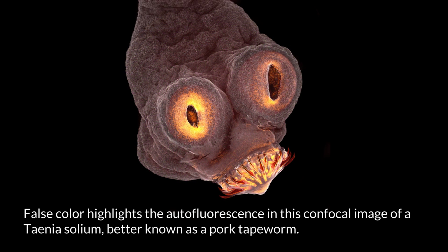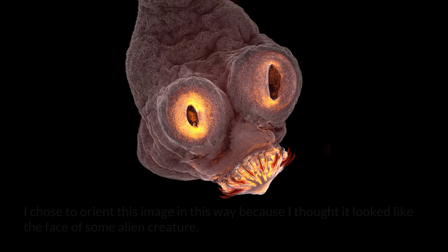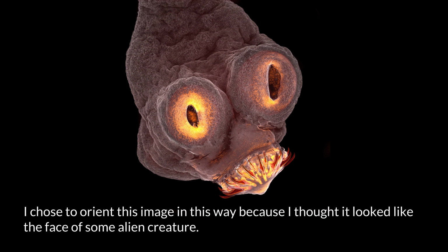False color highlights the autofluorescence in this confocal image of Taenia solium, better known as a pork tapeworm. I chose to orient this image in this way because I thought it looked like the face of some alien creature.